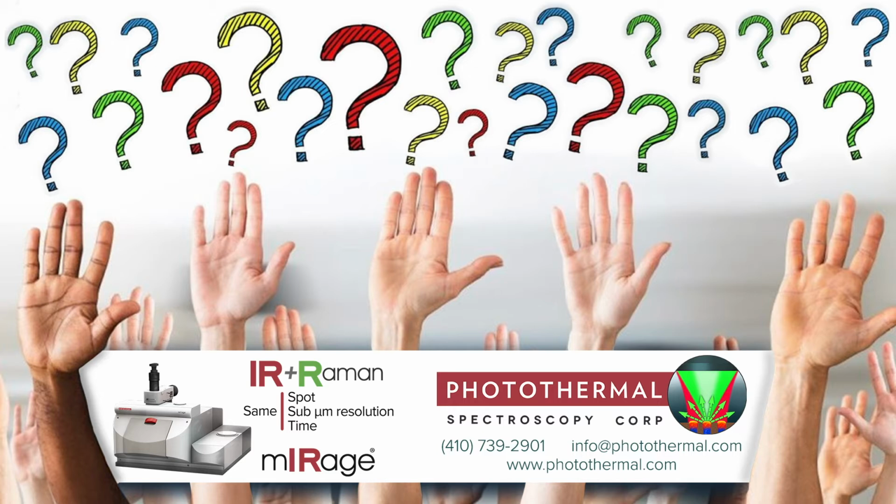We're not quite sure why they aren't attaching. And when they're on the bottom surface, you start to see a bigger water contribution. So there are still some issues, but we've got a guy working on that.